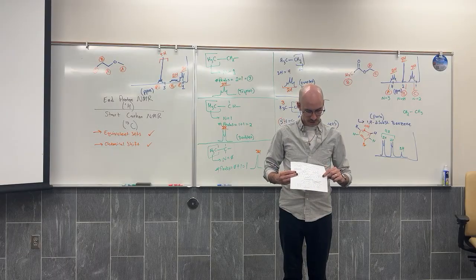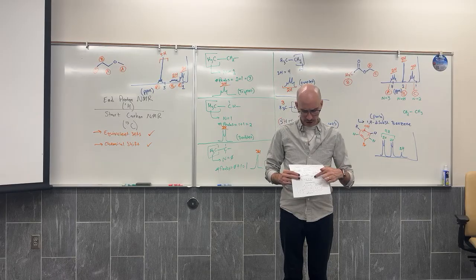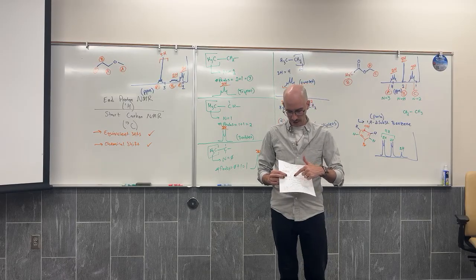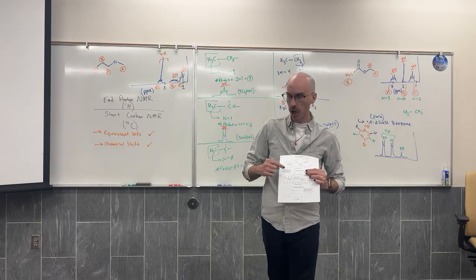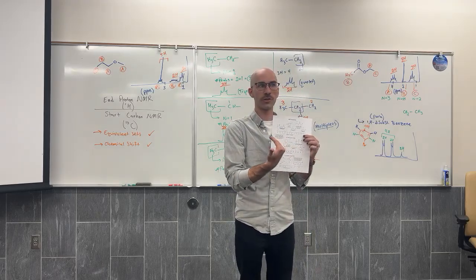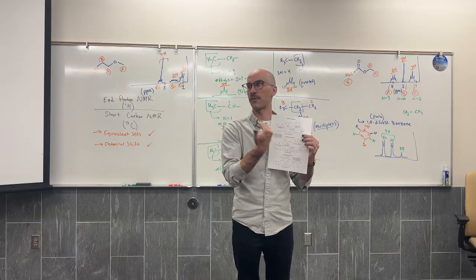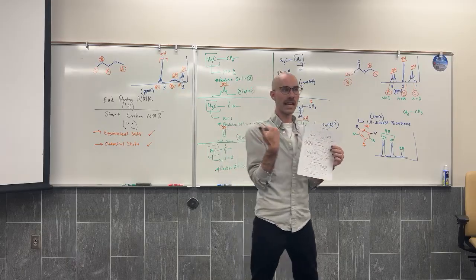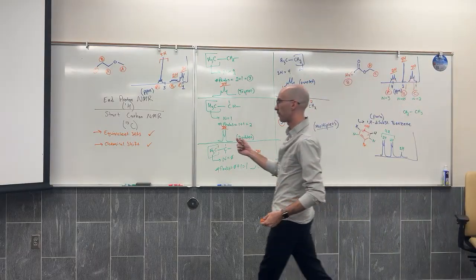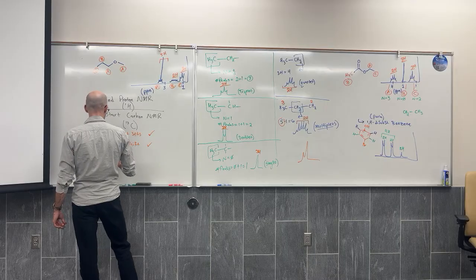You know what's on the furthest right? Alkane carbons. Then carbons adjacent to heteroatoms, alkyne carbons, nitrile carbons, alkene carbons, aromatic carbons, and then carbonyl carbons. So once again, the closer you are to those functional groups, especially the carbonyls, the further left the signal goes, because it's the same shielding and deshielding situation. So chemical shift is all the same. Integration.